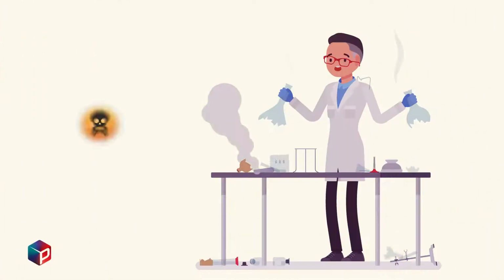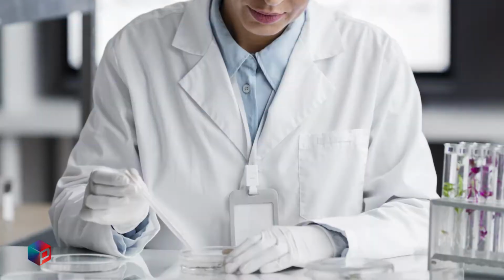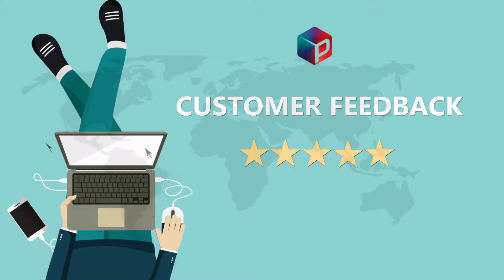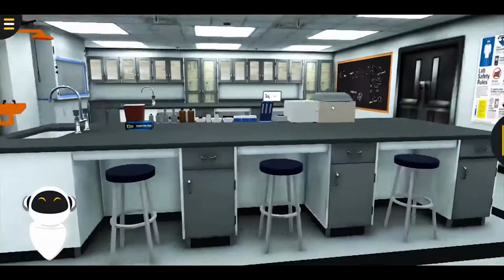The danger of dealing with these substances lies in the easy exposure to them by contact with the skin or eyes, inhalation of toxic fumes, and entry into the lungs, and swallowing when using pipettes. The solution to avoid the danger of these substances: use a real-life chemistry lab only when necessary. Use virtual labs instead to conduct experiments frequently.